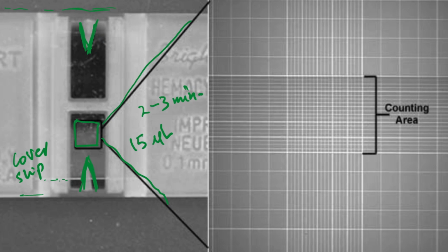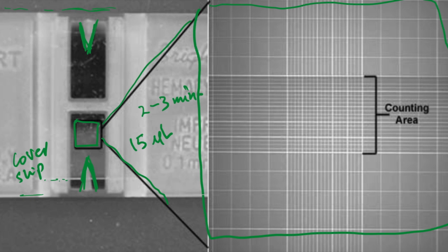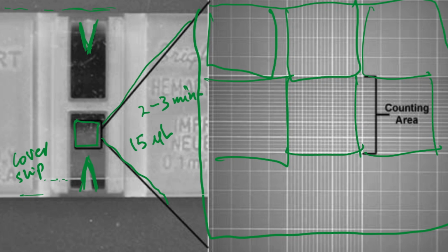And the counting process comes with certain rules. We're looking at a grid, and we could consider these 9 large squares. We could further divide our grid into these 9 squares, and we could consider that as our reading. Once these 9 squares have been designed, what we are interested in is looking at the individual cells placed in them.